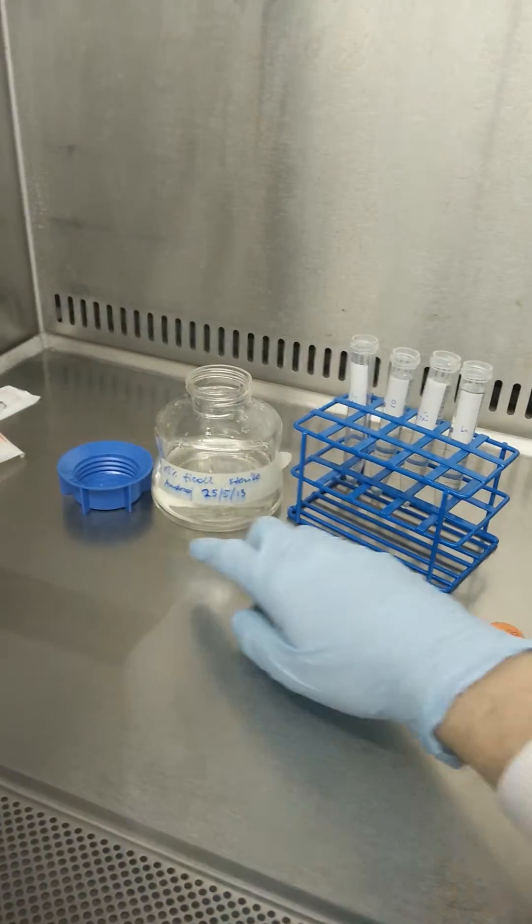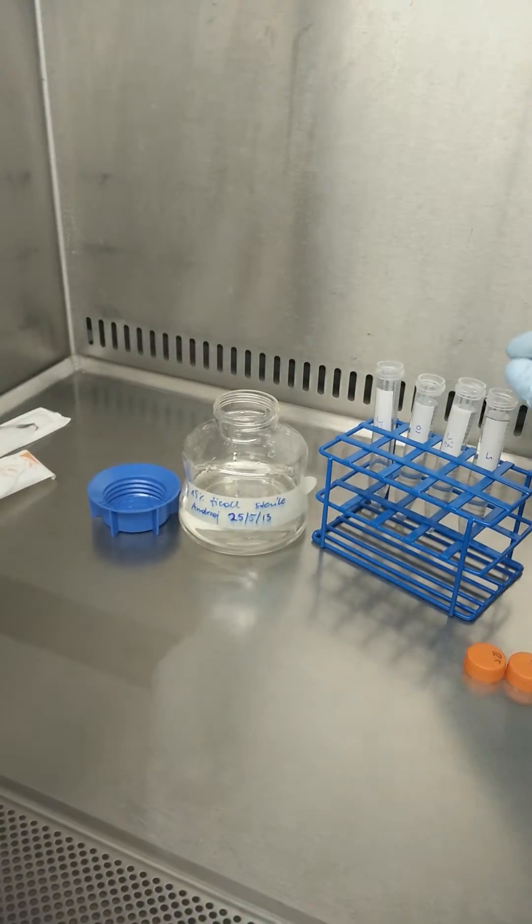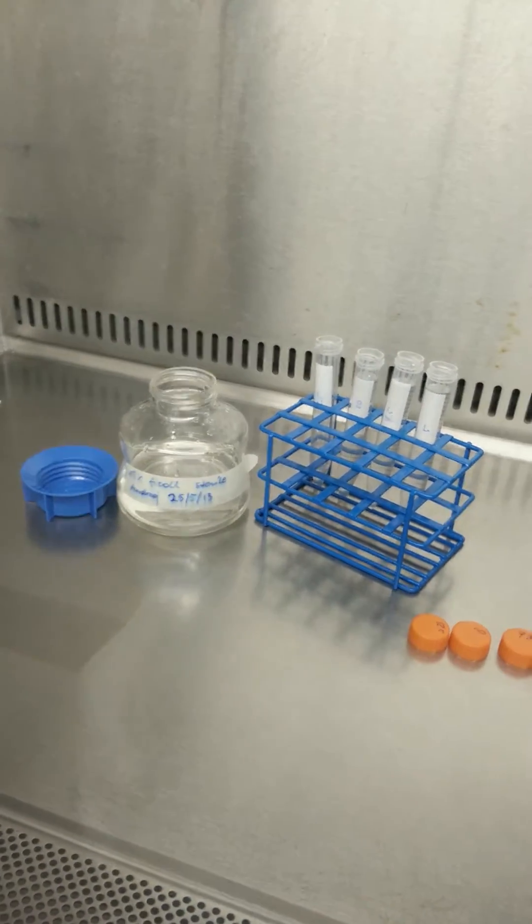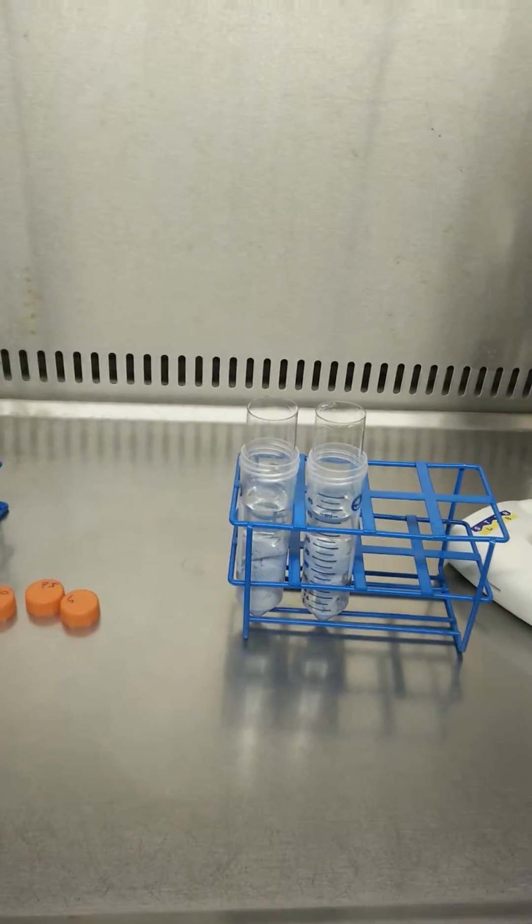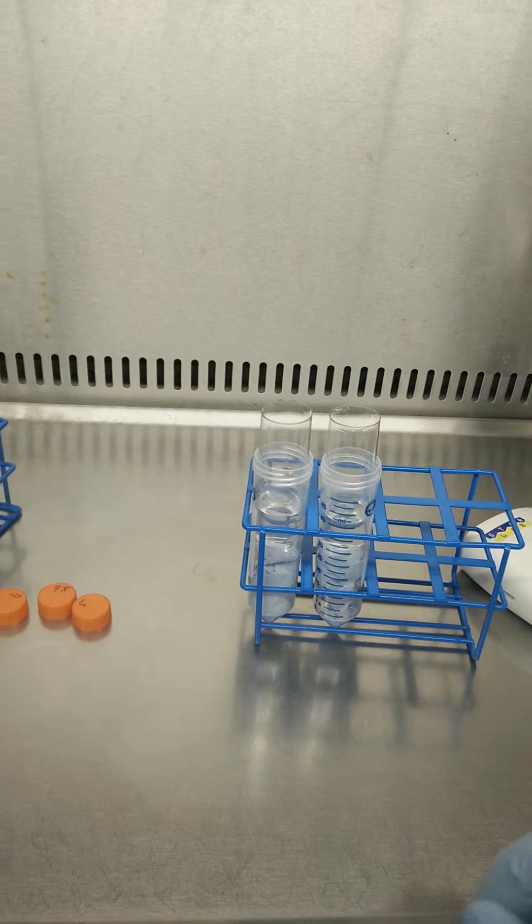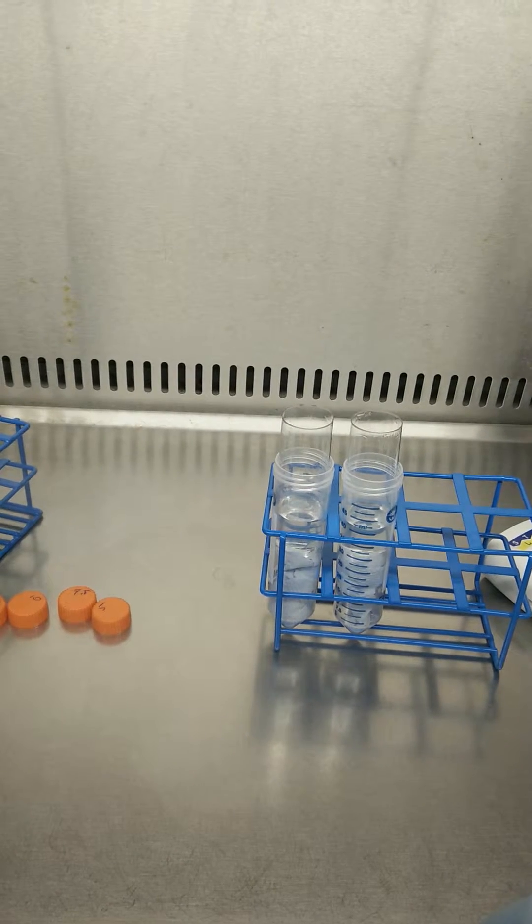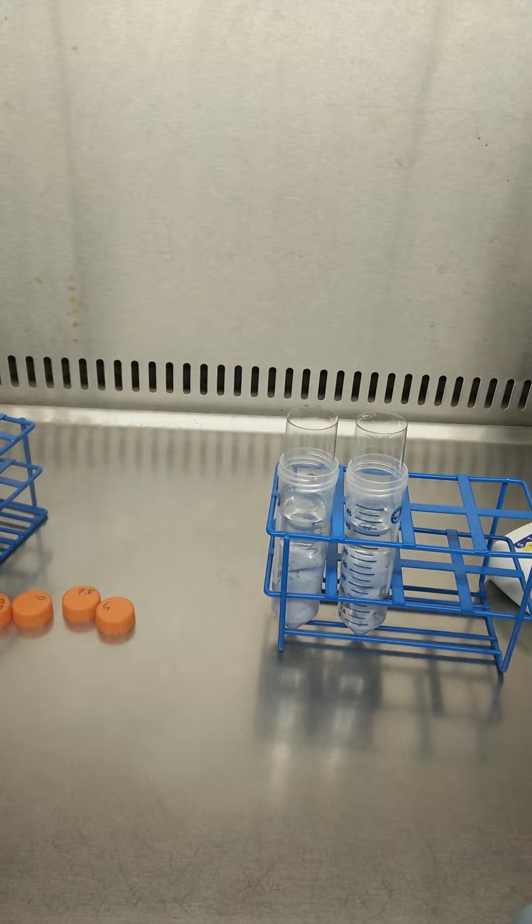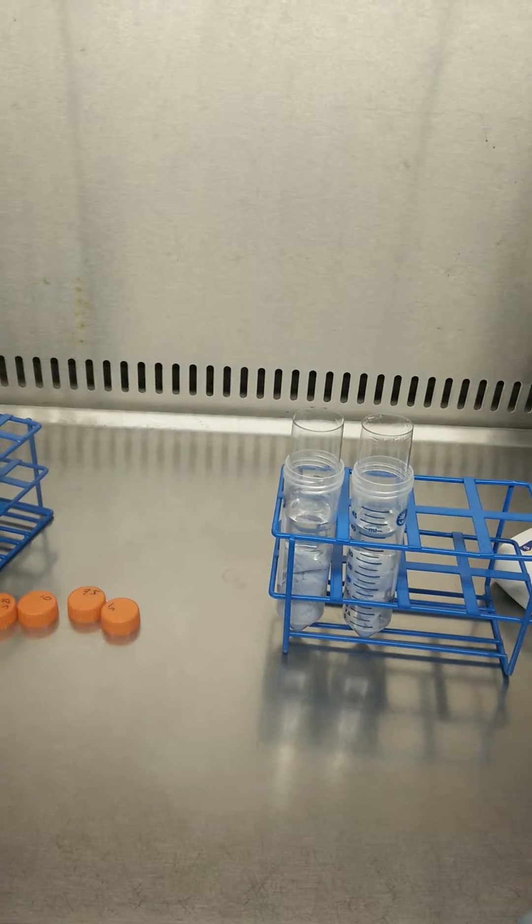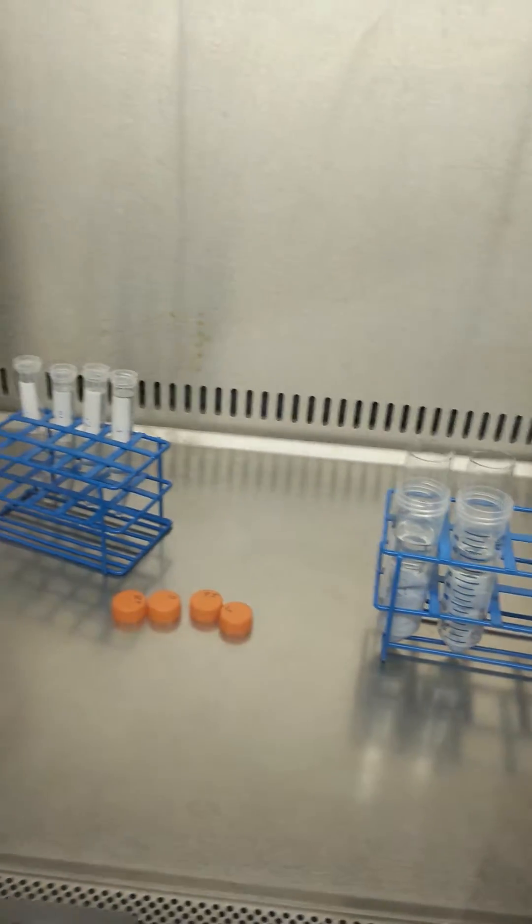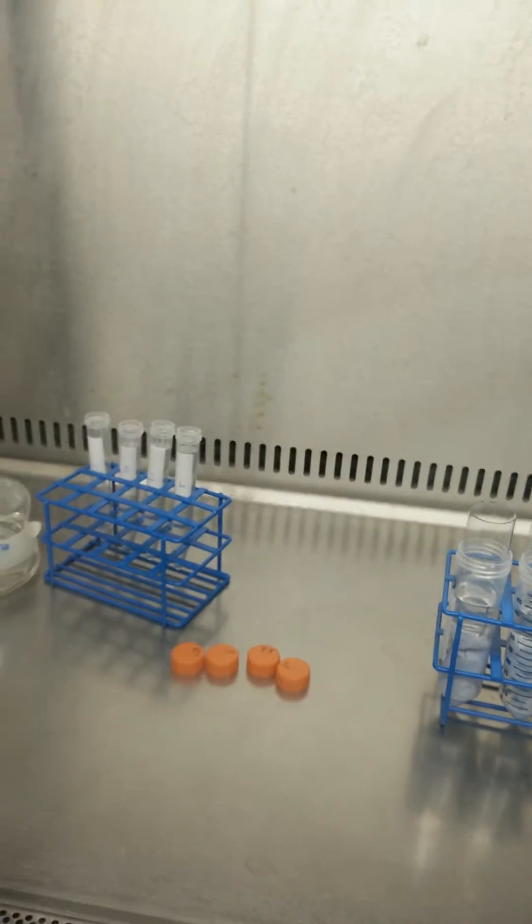I have here solutions of different densities from 15% to 5%, and I need to put them in these tubes, layer them on top of one another. The thing is that I need to do it very slowly so that the layers don't mix with one another, and I need to do it in this hood so that it's all perfectly sterile.